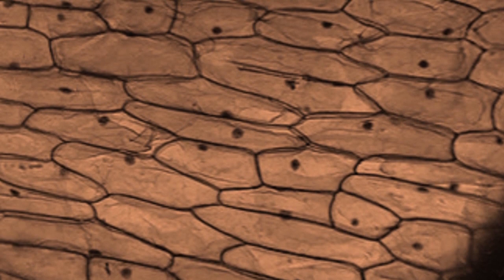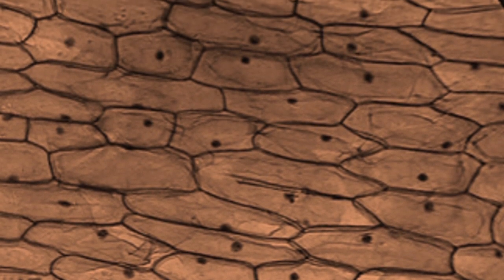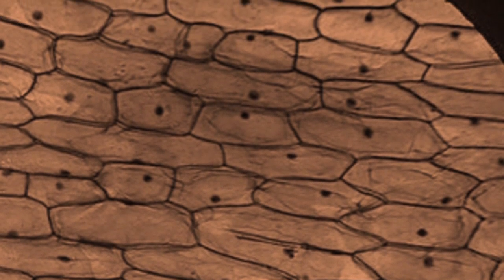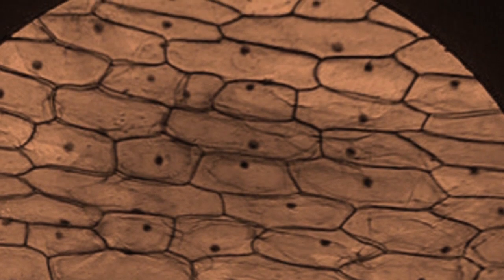What you should see is something similar to this. You can see how plant cells are so highly structured. They all have a fixed rectangular shape and they fit together much like bricks in a wall. If you look closely, you can see the cell wall and the nucleus of each of these plant cells.